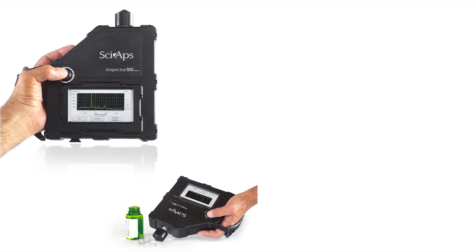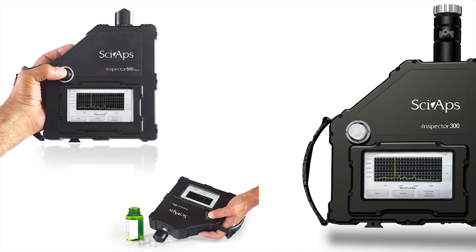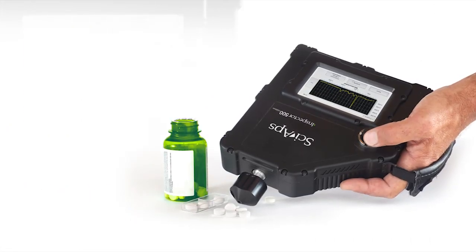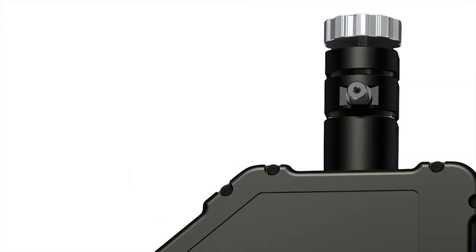Both models are perfectly balanced for one-handed use, highlighted by a well-located wrist strap. It has a large colorful screen and easy to drive icons. The laser emits from a narrow snout and has a tapered trapezoidal body, ideal for reaching difficult test locations.